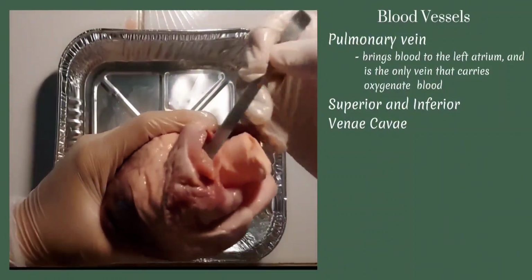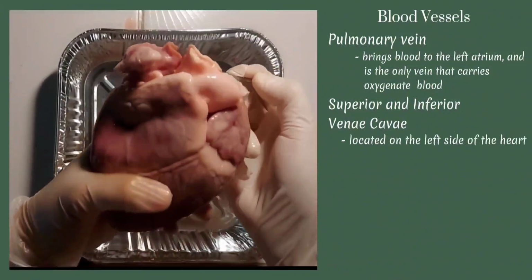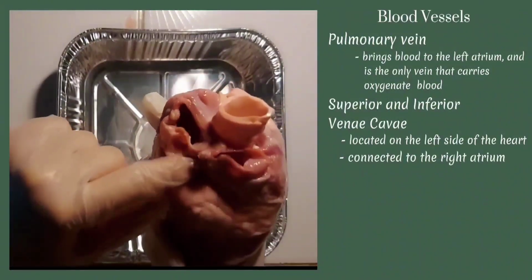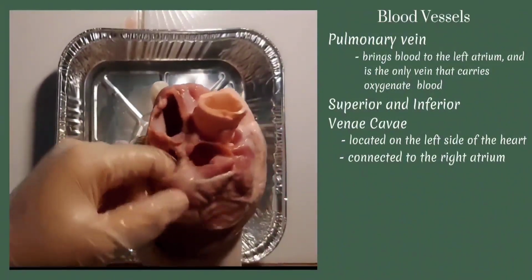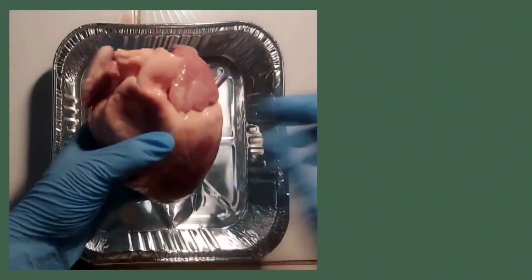These are the superior and inferior vena cava. These are located on the left side of the heart and are connected to the right atrium. As you can see, the superior vena cava is just above the right atrium and the inferior vena cava is just below the right atrium.